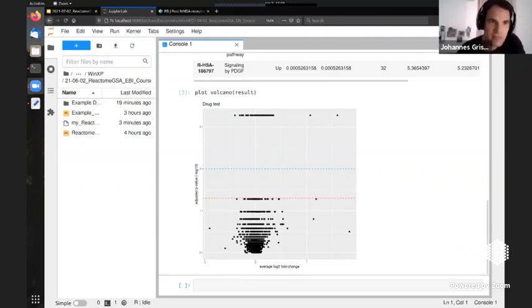Do you think we can treat phosphoproteomics data as proteomics? Okay, so that's really important about phosphoproteomics. So yes, you could, but of course, Reactome is phosphosite agnostic. And if you do phospho, it really makes a huge difference which phosphosite at which location is differentially regulated. That's kind of your key information. And that kind of positional information would be lost here. So yes, you can use it, but you will lose a lot.